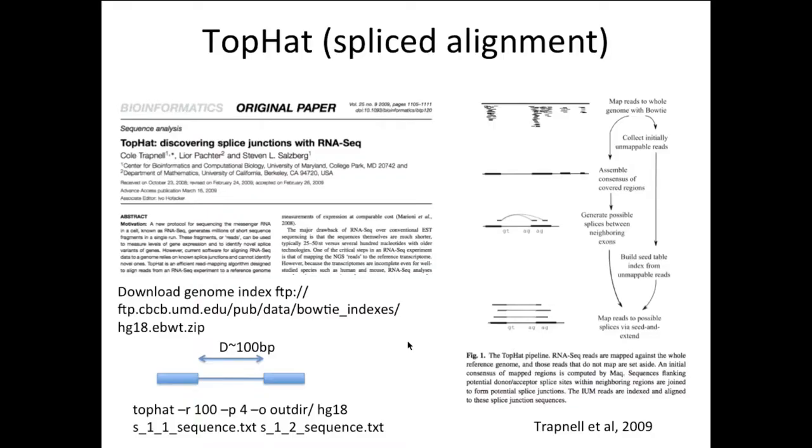So this is a complex process, and a lot of people are working on this. This is aligning RNA-seq reads back to the genome. It is a difficult process because transcripts are processed: the exons, introns are spliced out, and you have exon junctions that are formed. These exon junctions don't exist on the reference human genome. So when you map your RNA-seq reads back to the reference human genome, a lot of reads don't map because the reference doesn't contain these exon junctions.